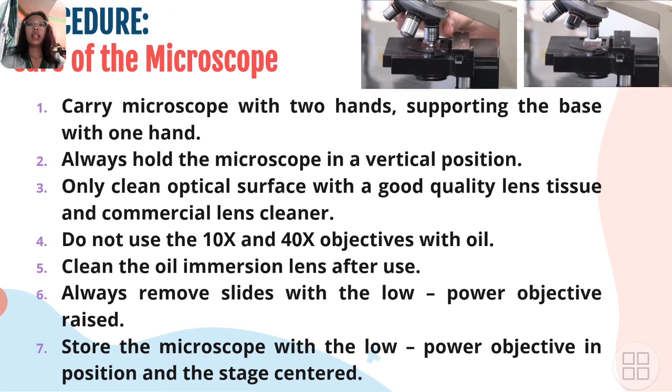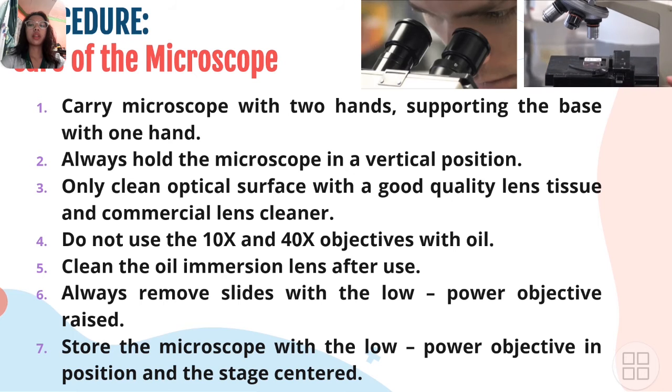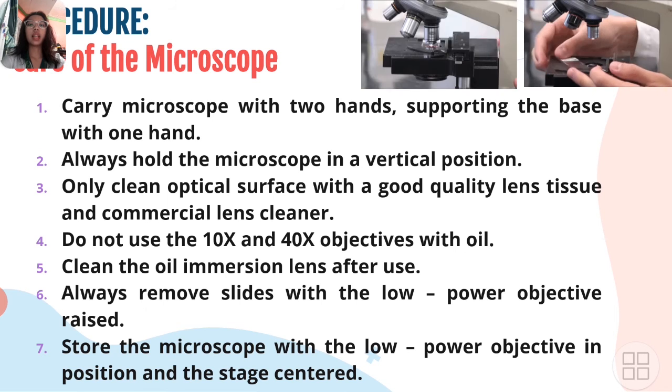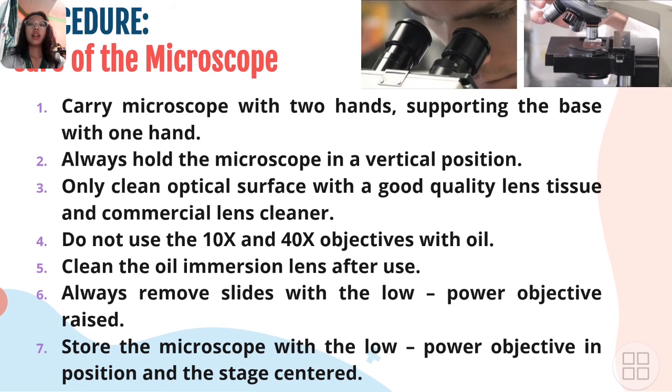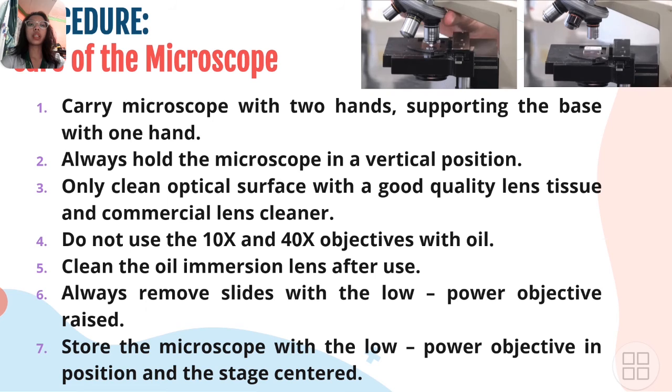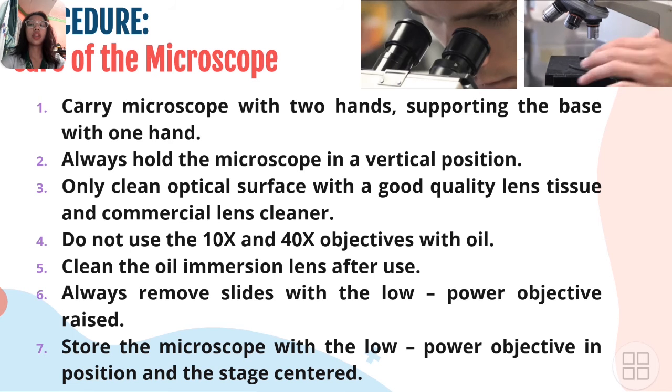Fifth, clean the oil immersion lens after use. Sixth, always remove slides with the low power objective raised. Seventh, store the microscope with the low power objective in position and the stage centered.